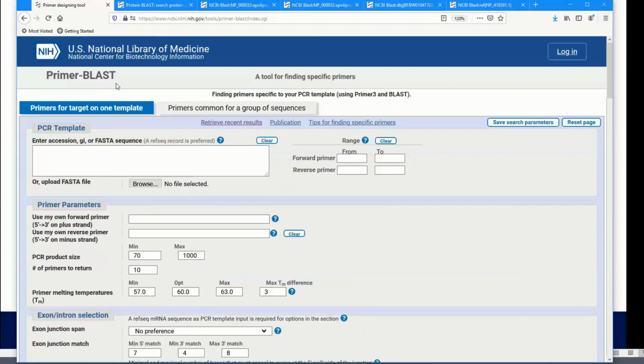Great. Another question, and this is a more basic BLAST question. They are interested in designing PCR primers, and often a single template gets selected or an accession gets put in this PCR template box. The question is, do they need to BLAST both the sense and antisense, or regular sequence and reverse complement, or can they get away with only using one? Just one. I'm not quite sure I understand the question. You can only put one strand in here, right? So you put your sequence in here, and it's going to design primers that you would put in this box eventually.